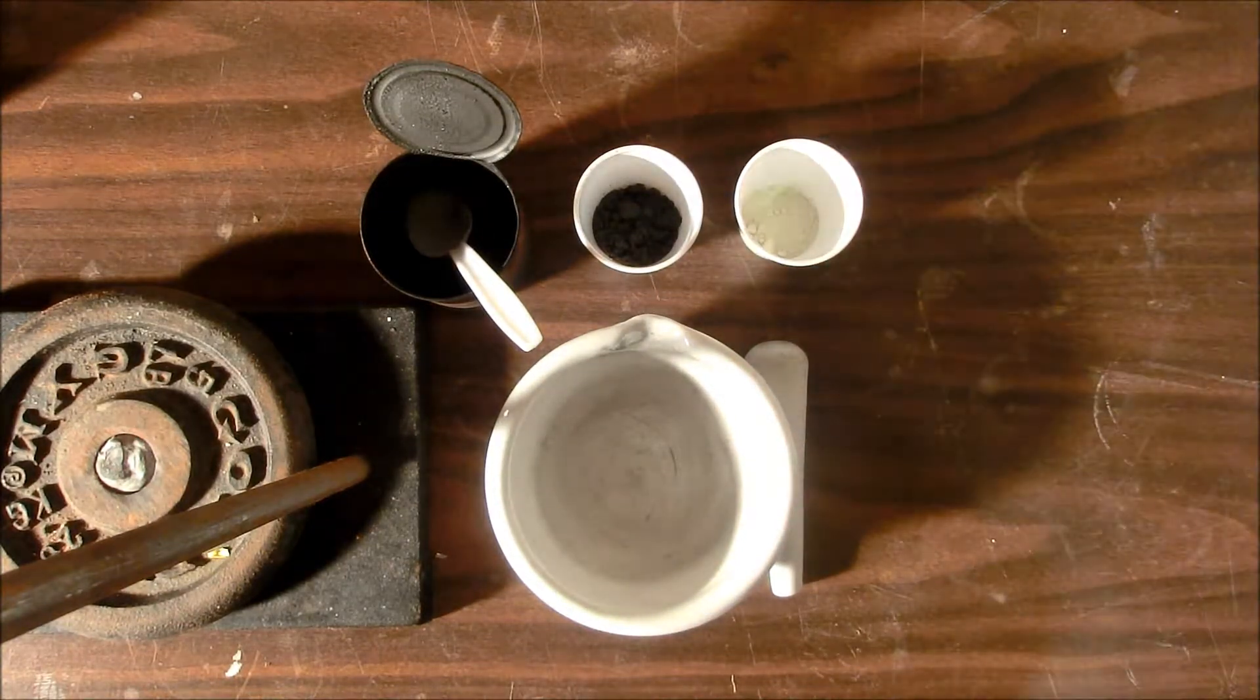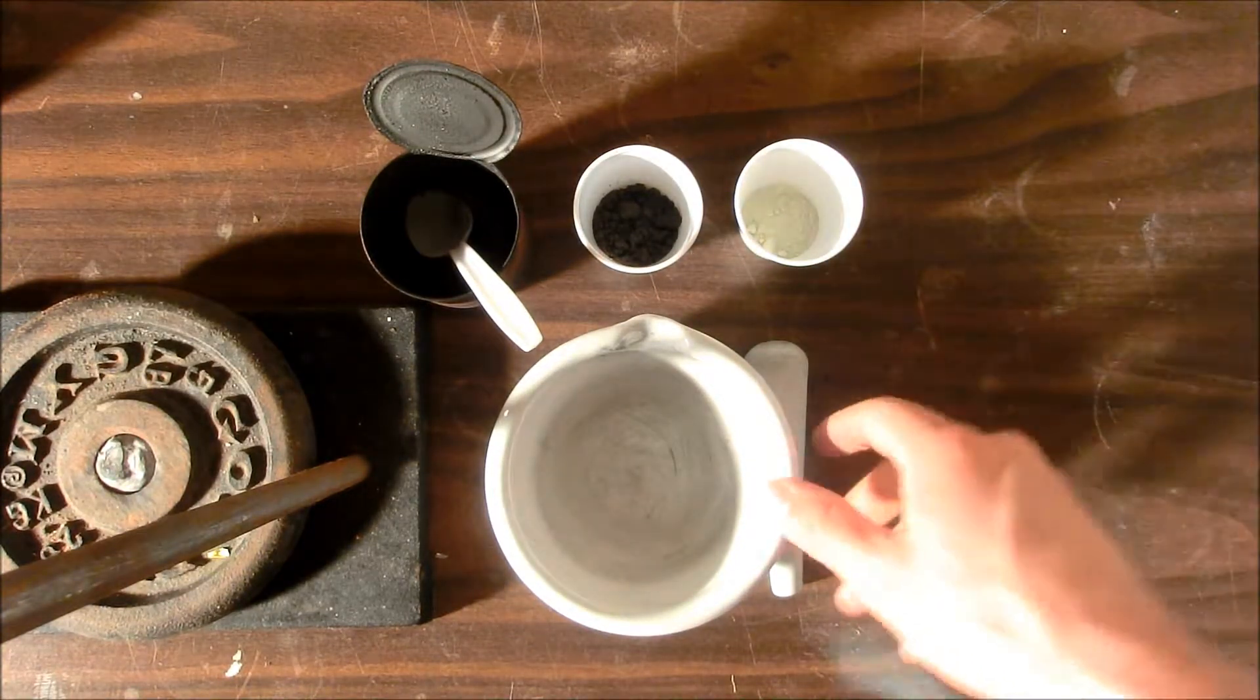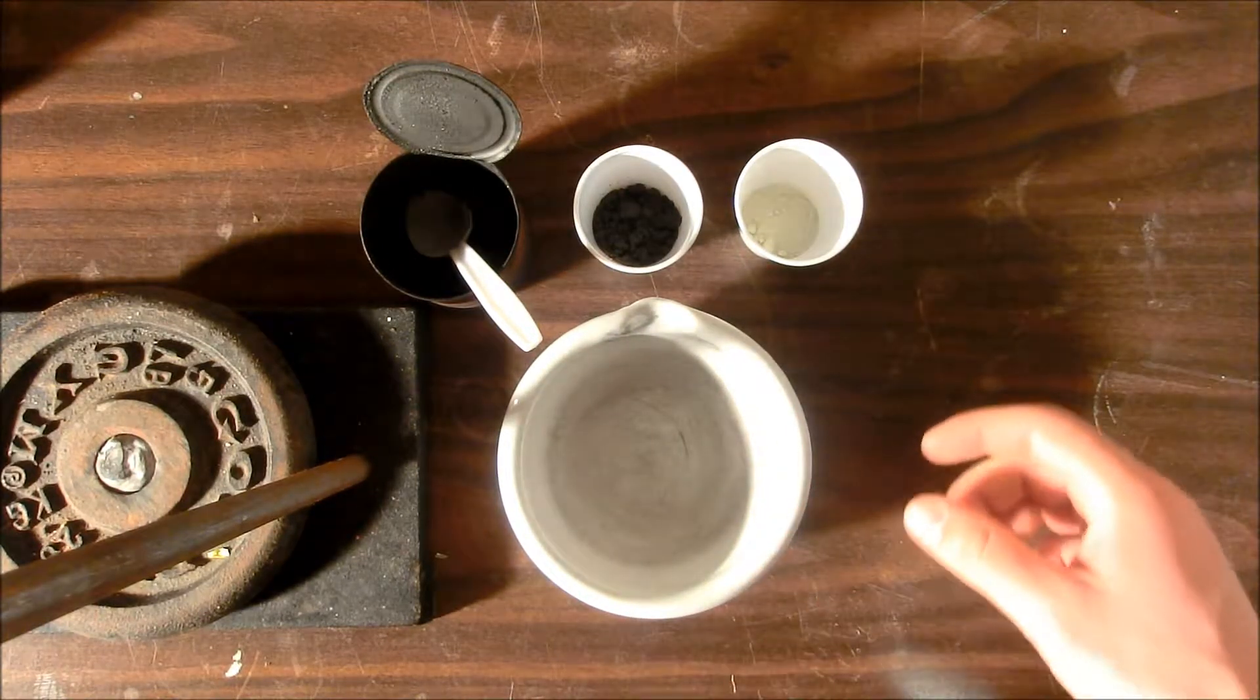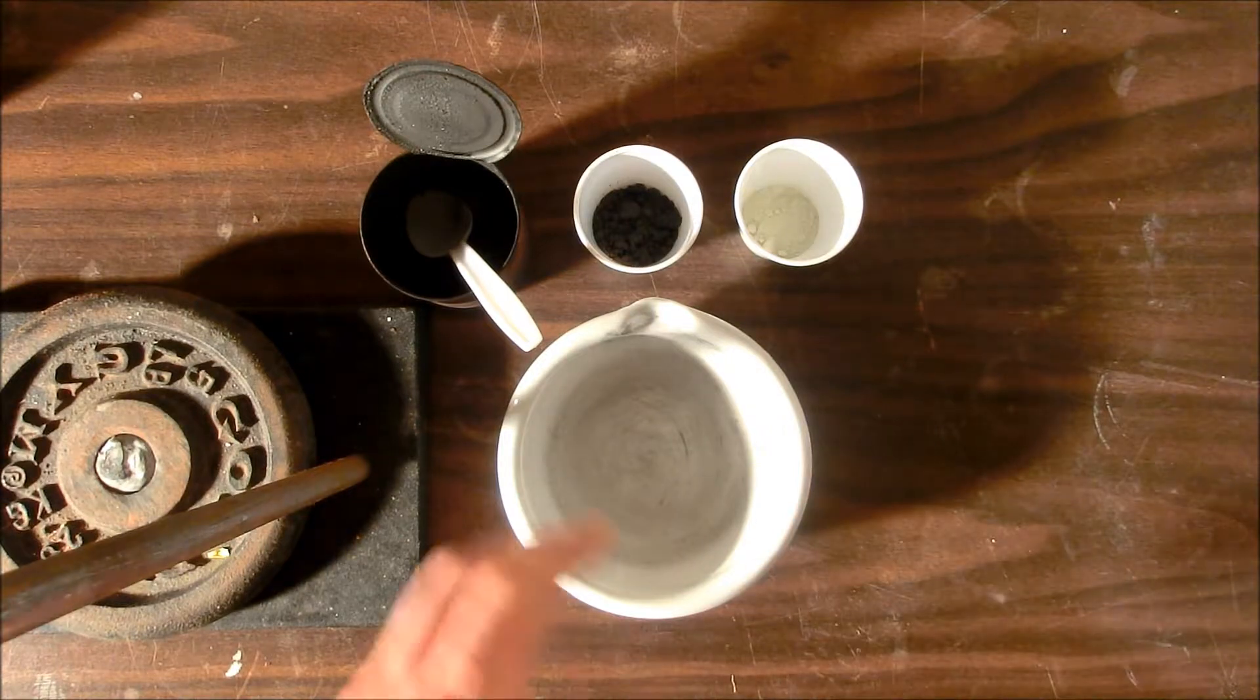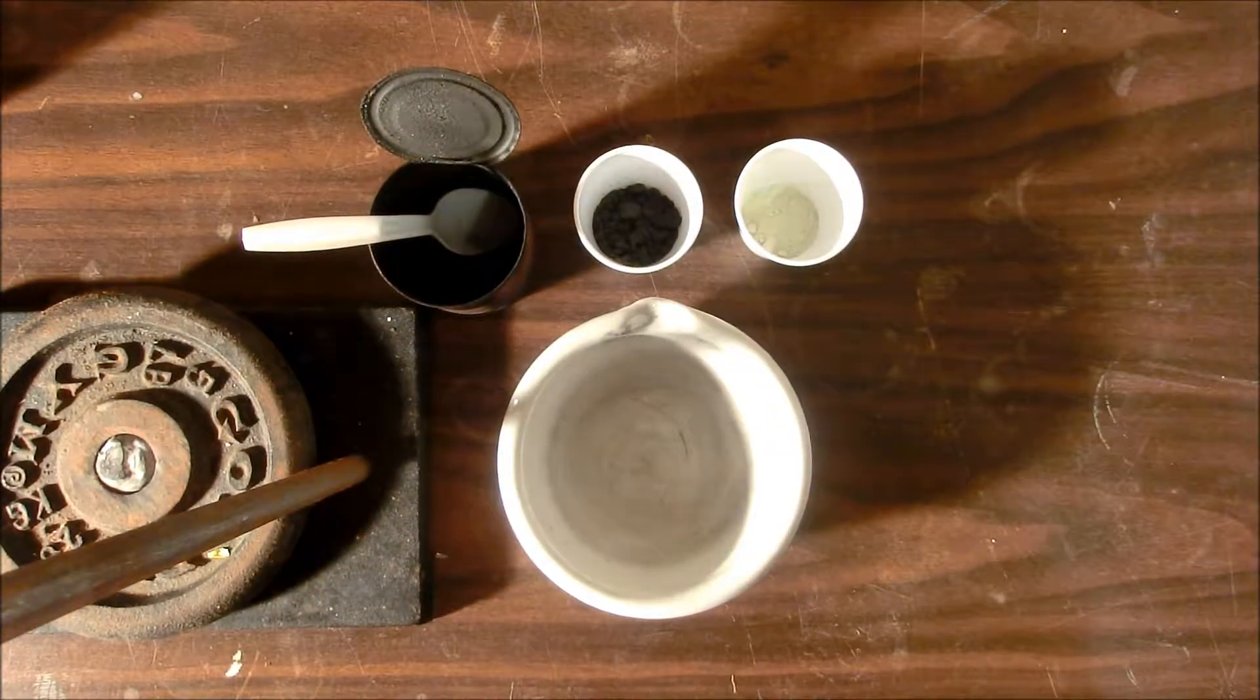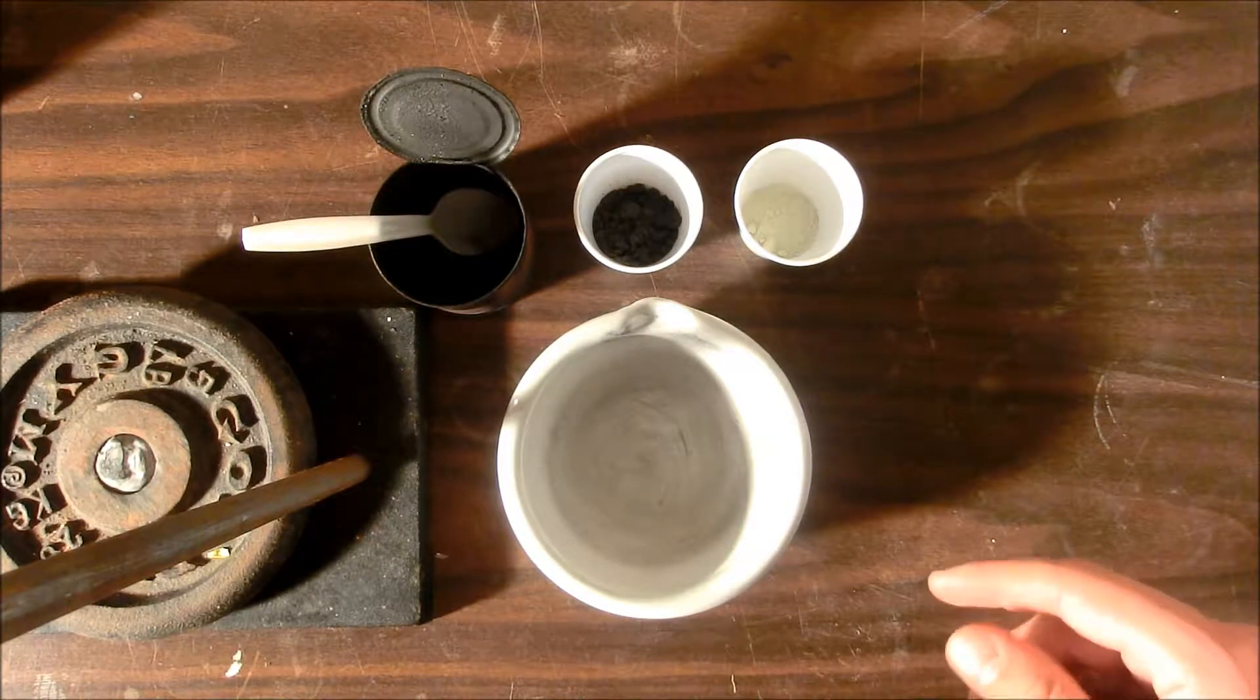So the next thing we're going to do is put these two components into this mortar and pestle, mix them up real good so we have a homogeneous mix, and then I will put them into this steel can and we're going to heat it up until the two react.